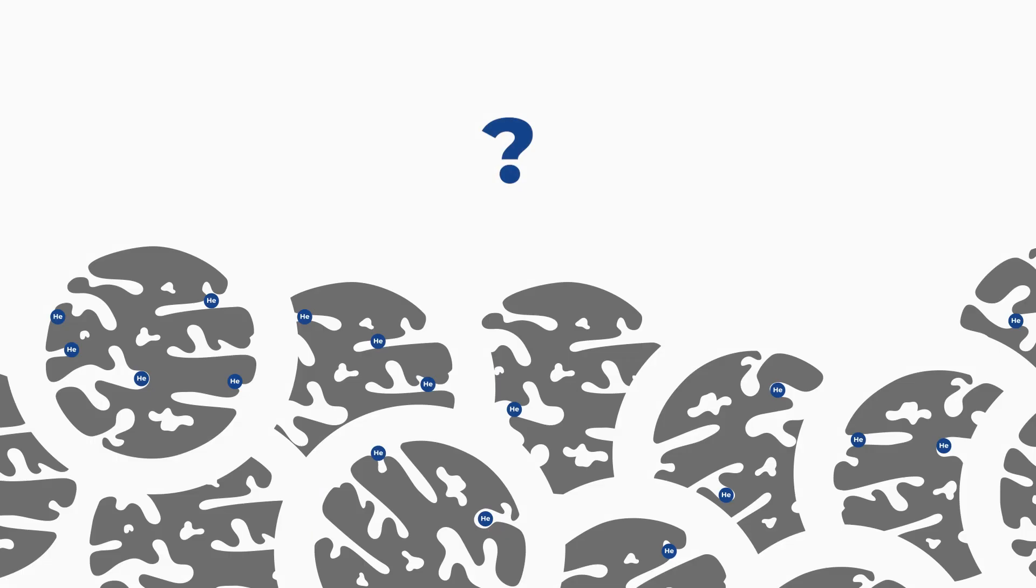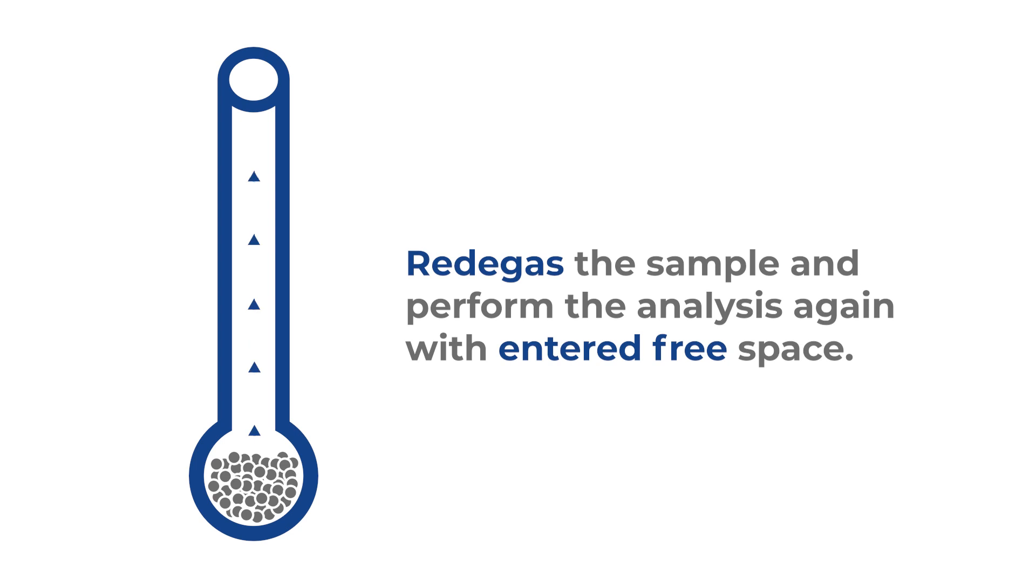If there is a suspicion that the sample is interacting with helium on a measured free space analysis, it is best to double-check with the following method. First, re-degas the sample and then perform the analysis again on the same sample tube with enter free space where the previously measured free space values are entered.